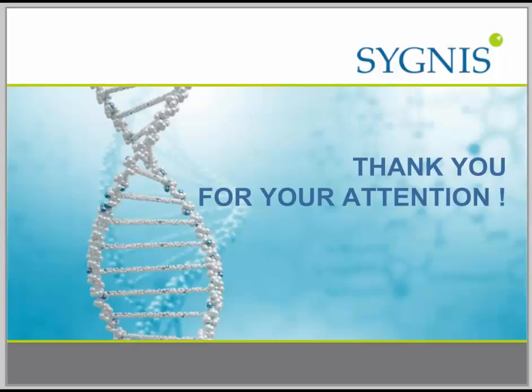Anybody else? Another one. What precautions should be taken to avoid contamination when setting up single-cell amplification? Great question. That's really a very good question. We produce these kits, and we take an incredible amount of precautions to produce these kits in a non-contaminated form.